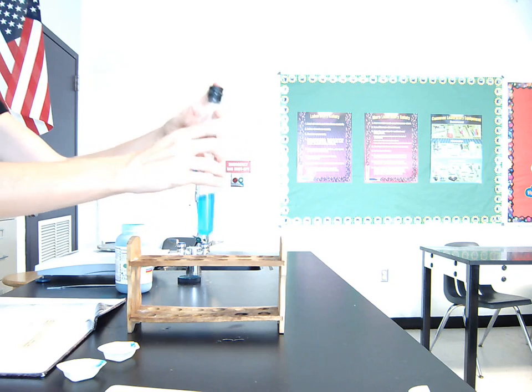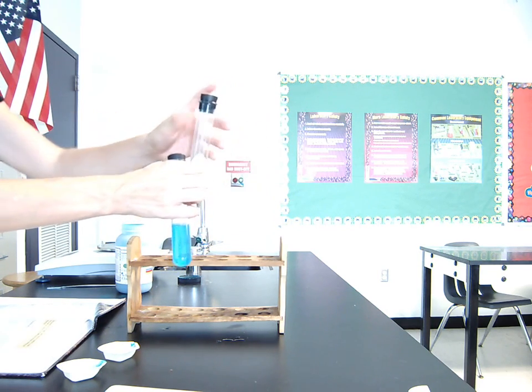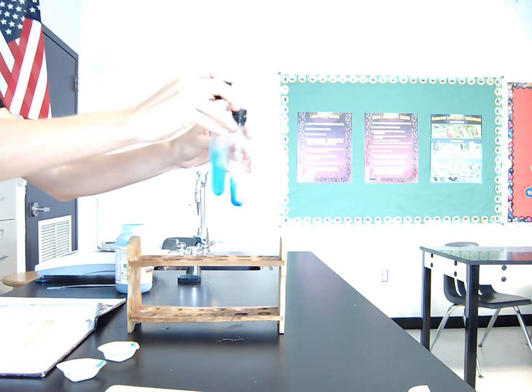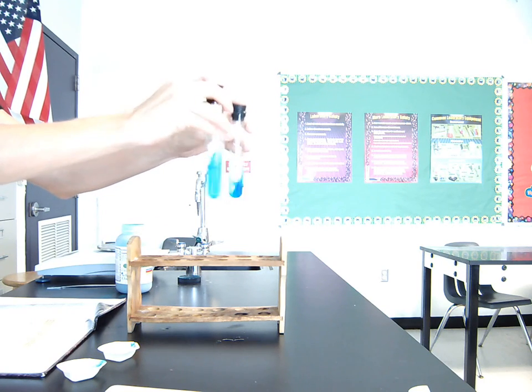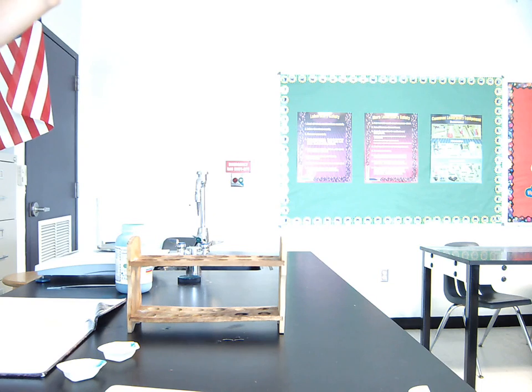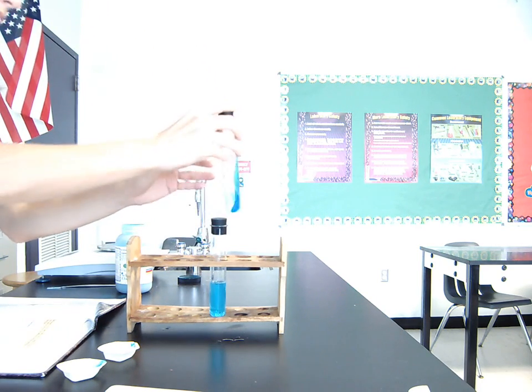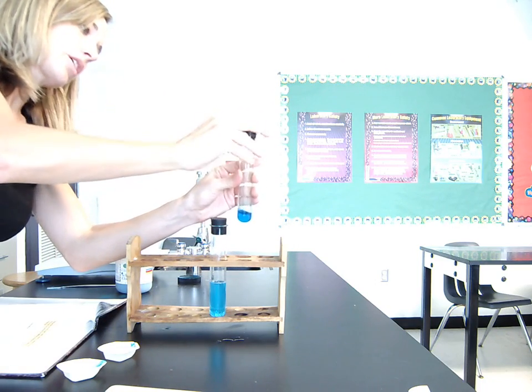You don't want to turn it sideways or shake it too vigorously because this one's already leaking a little bit. I got some blue stuff in my hands. So it makes the dissolving process a little bit tricky because I can't really shake it as thoroughly as I would like to, so it's going to take a little bit longer. Almost. So we're leaking all over the place. There we go, let's get that out of there.